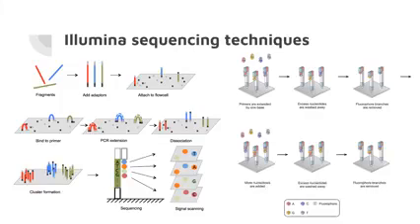And what we do is we synthesize the complementary strand of that fragment, and then we detach them from the flow cell, and then it attaches to another part of the flow cell, and then we synthesize that, and it attaches, and so we end up with these clusters. Then we wash away the complementary strand, so we only get one direction sticking up.